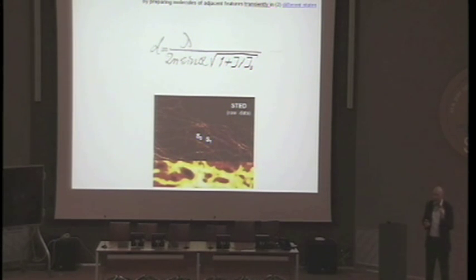And this is what, in my view, was forgotten. People were just focused on waves. They thought they have to change the waves, putting in a needle or tip or anything, or maybe design special materials together. The waves behave differently. My take is let the waves go and do what they want. Let them propagate freely. Why violate the propagation of waves? Let the waves go out. Do the separation by the states. And that's the point. Resolution is not just about waves.